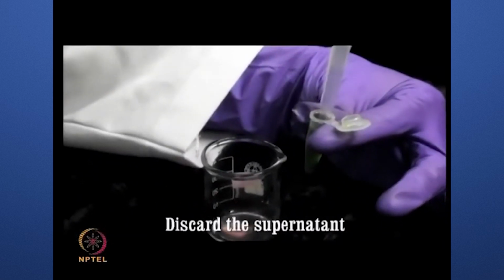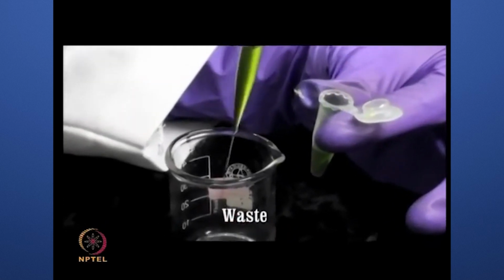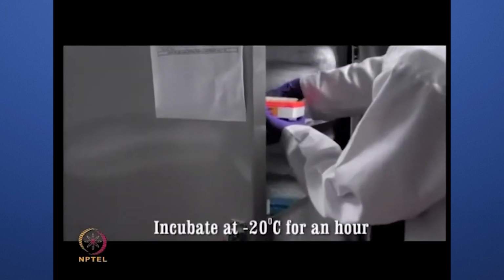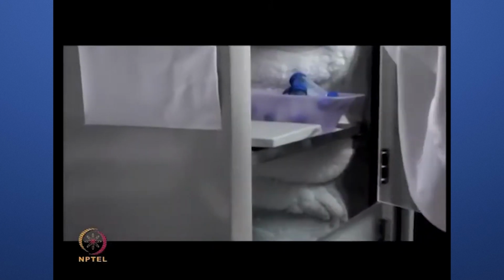Discard the supernatant and retain the pellet containing plant proteins along with various other intracellular components. Incubate the pellet at -20 degrees Celsius for an hour.